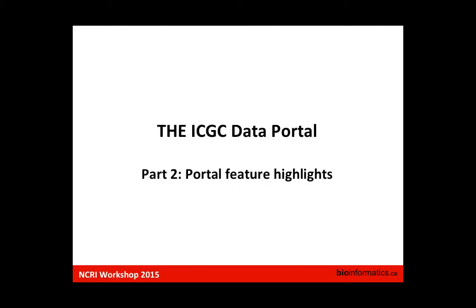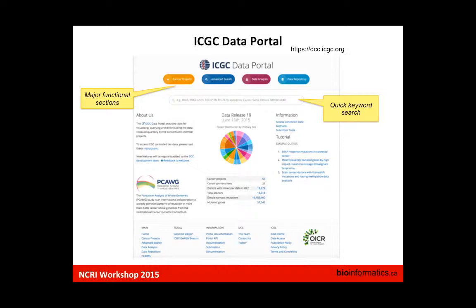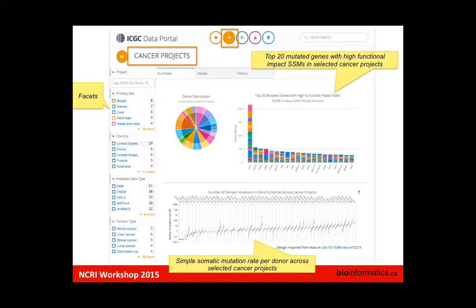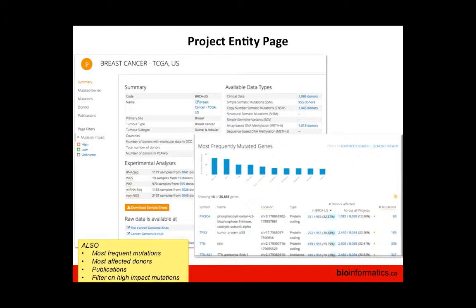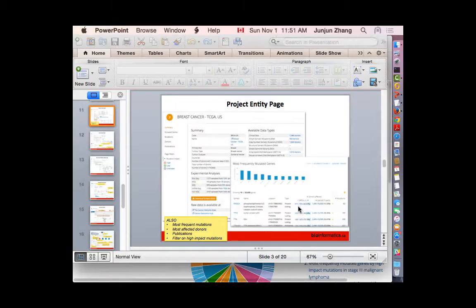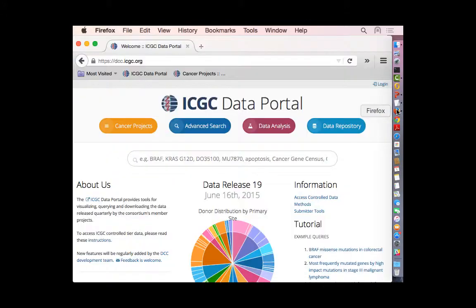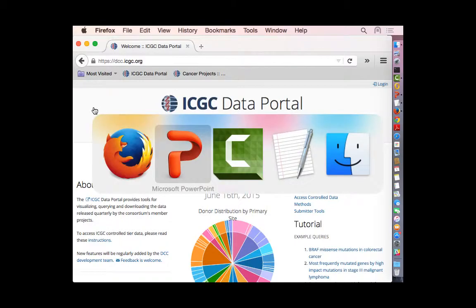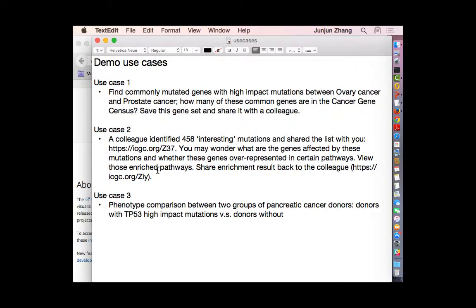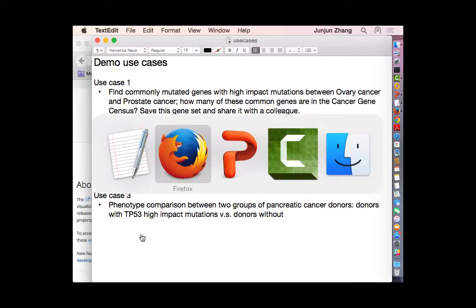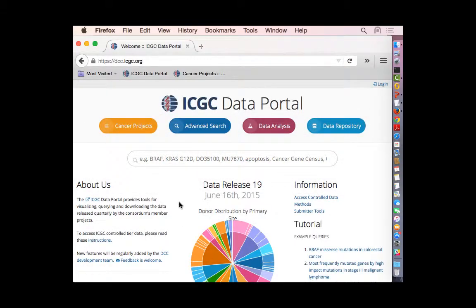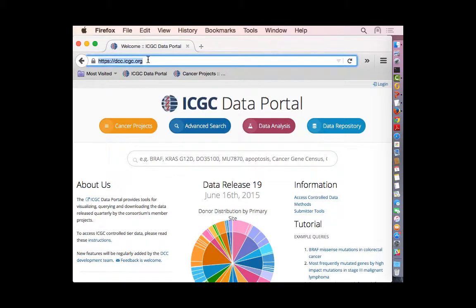That's the introduction. We have a few slides showing how the website is organized — I'm not going through this because it's all in your handout, so you can use that as a reference. Now I'm going to jump into the demo. I'm going to walk you through different pages, click through different links, and at the end demonstrate some useful use cases. The homepage is dcc.icgc.org.